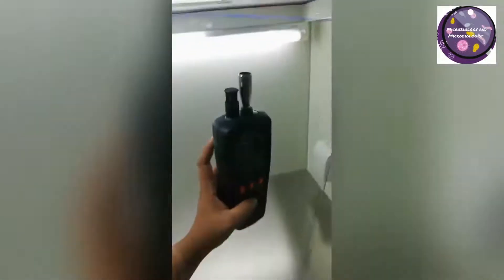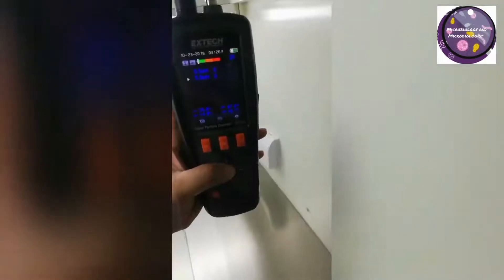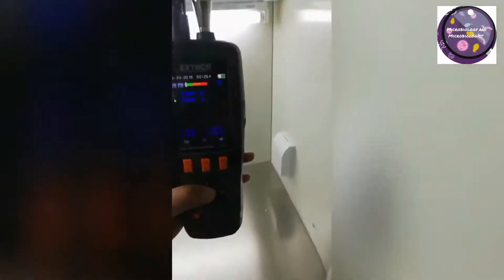We are measuring the particles collectively for 60 seconds, and after collecting the data we will calculate the particle count using correction factors.